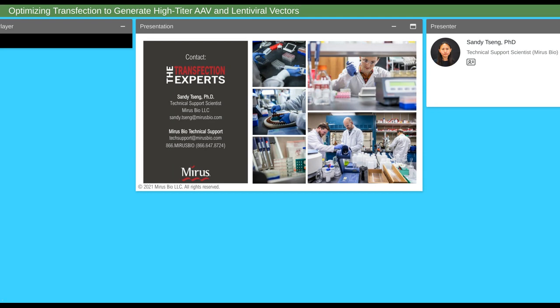And anything that is dramatically different from this, like maybe something crazy like 10:1, would cause the complexes to form a little bit too quickly. Something that's dramatically smaller than this, let's say like 0.25:1, would have the reverse problem. So you can definitely get away with differing in the ratio there, but I would stick to the general range of 1:1 to about maybe even 5:1. Yes, I hope that answered your question. If you want to clarify more, you can feel free to add another question.